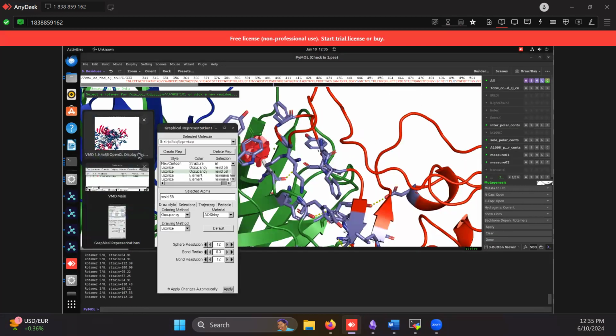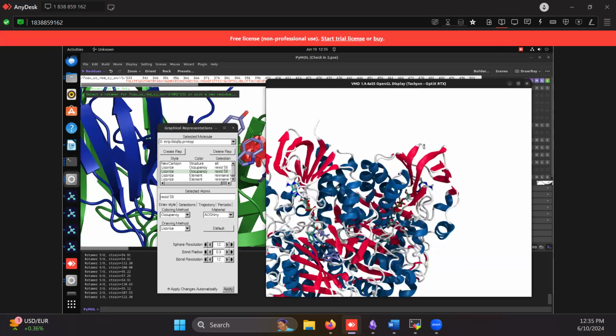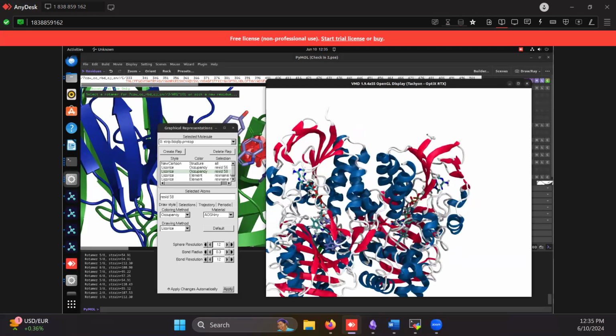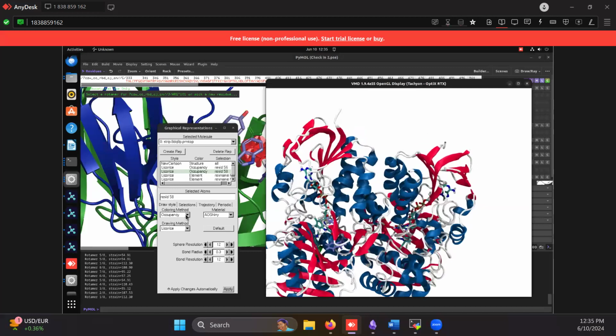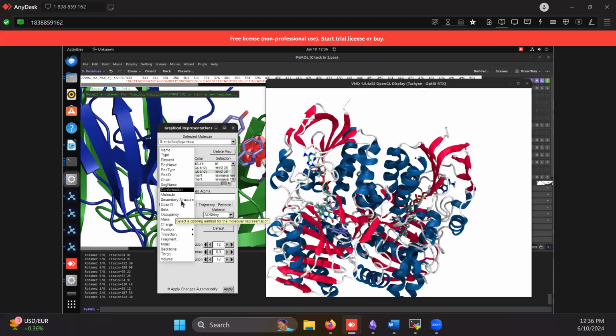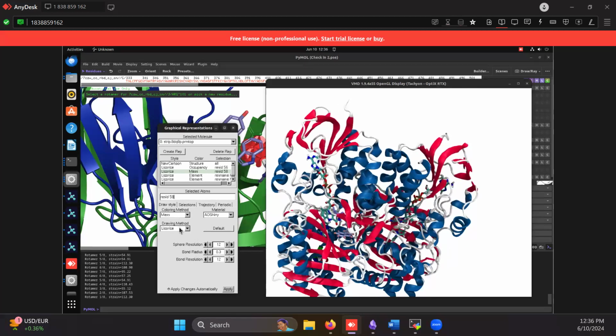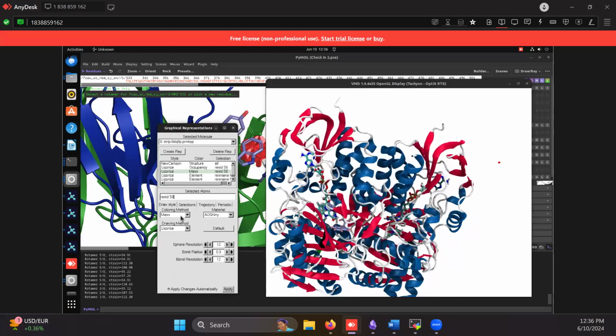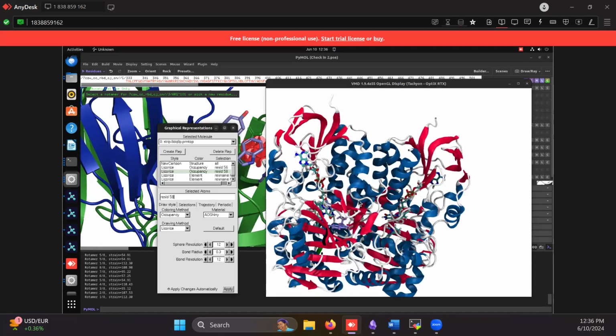I wanted to have a way to separate them visually from the ligands, because if they're the same coloring type as the ligands, it's difficult to see where the residues are compared to the ligands. It can be any other method. Occupancy just colors them one way. It can be anything. It can be by mass. By mass is slightly different. These are just preset configurations. There is a way to set your own colors, which is what I've done.